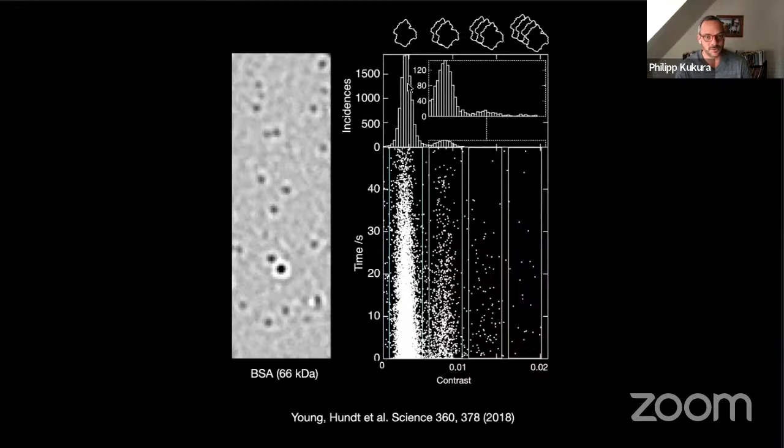And he's kind of coming to the point where he says, well, you need a pretty difficult problem in order to really take full advantage of the capabilities of native mass spec if what you're looking at are proteins. That changes completely if you're looking at protein small molecule interactions, lipidomics. There's 100 million things that mass spec can do that we cannot do, and we will probably never be able to do. It's just not within the capabilities of the technology.